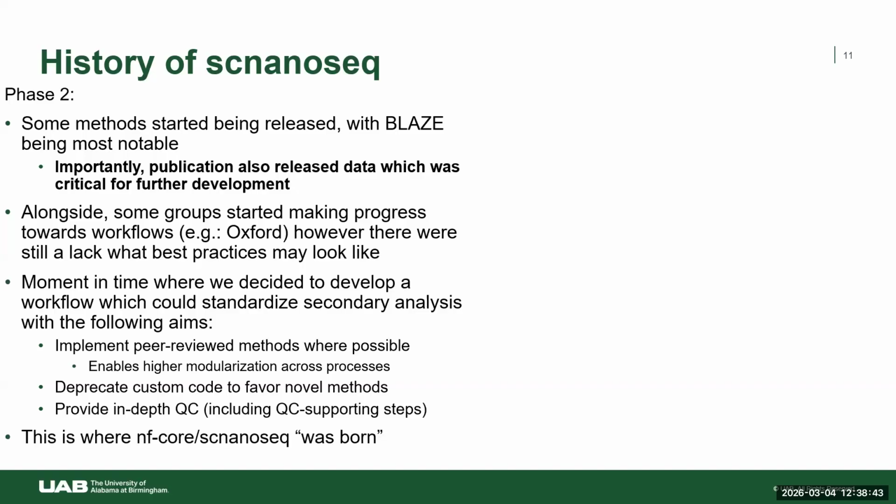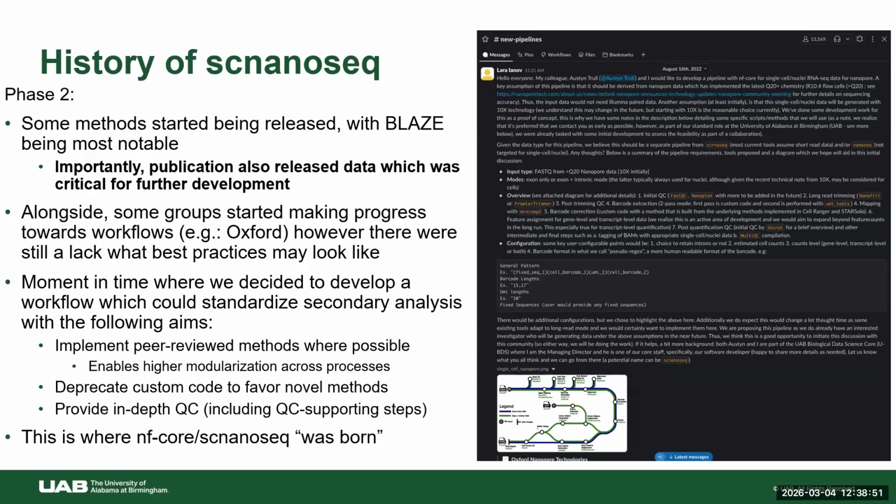And I consider this point in time the time where nf-core/scnanoseq was truly born. As a response to that, we officially submitted this workflow as a project to nf-core, which in 2022 included a very lengthy Slack message to their Slack channel called New Pipelines. That was just the process. You always want to submit things to nf-core first, because they try not to have duplicated efforts across different pipelines. So we went in depth, included a preliminary version of the method diagram, and then we got it approved to develop this as part of the nf-core community.